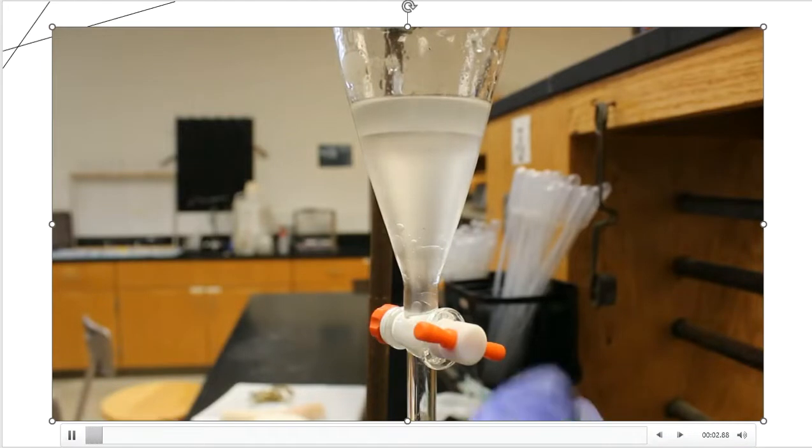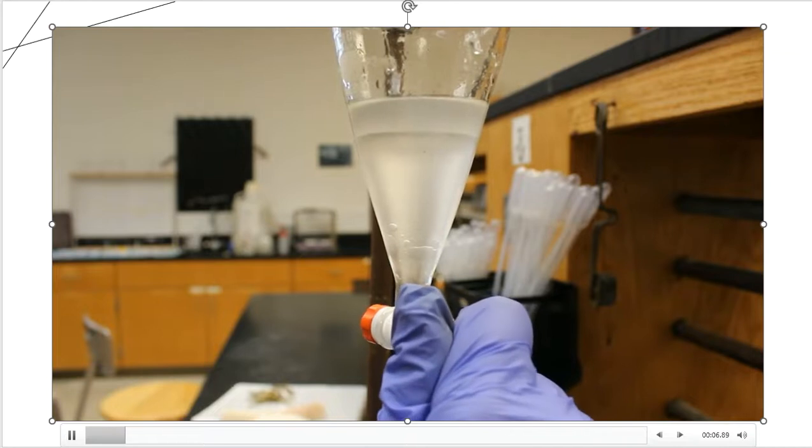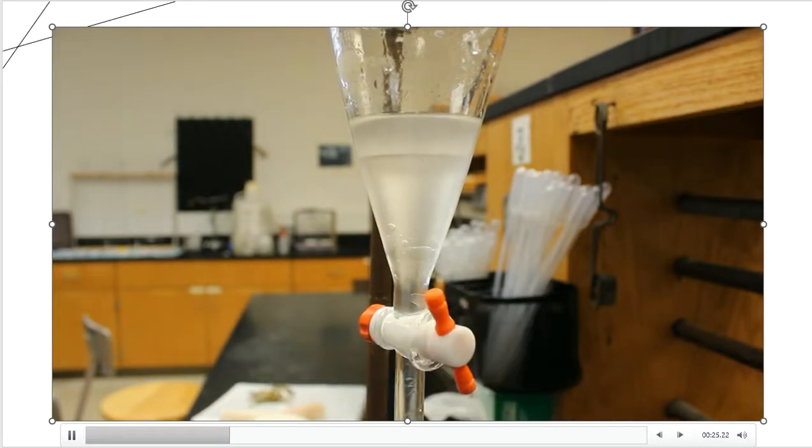Okay, so I'm getting ready to drain the bottom layer off, and it's pretty easy. I just open up the separatory funnel and allow it to slowly drain into a beaker that I've got sitting down below. You probably can't see that on the screen, but that's all that I'm really doing. So nothing special there at the tail end of the screen that you can't see. I'm going to allow this solution to continue to drain.